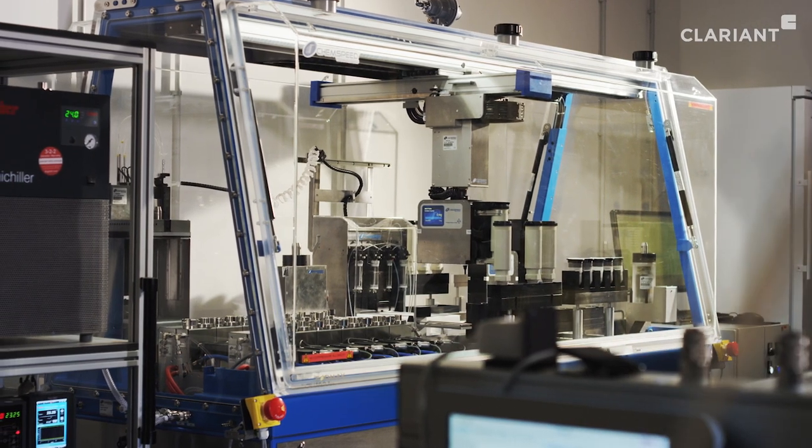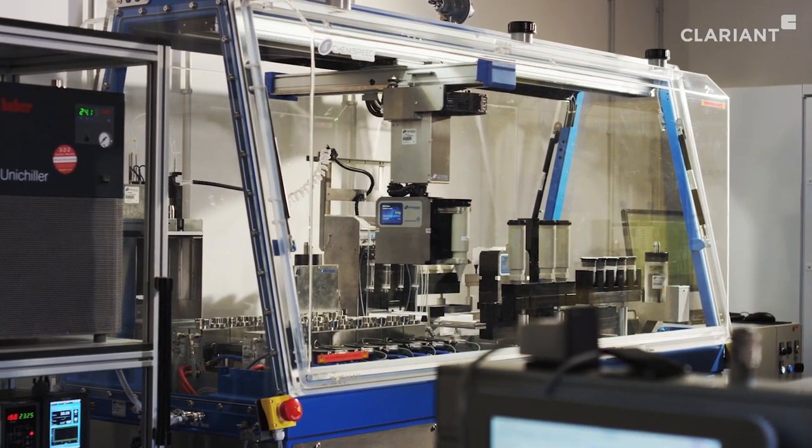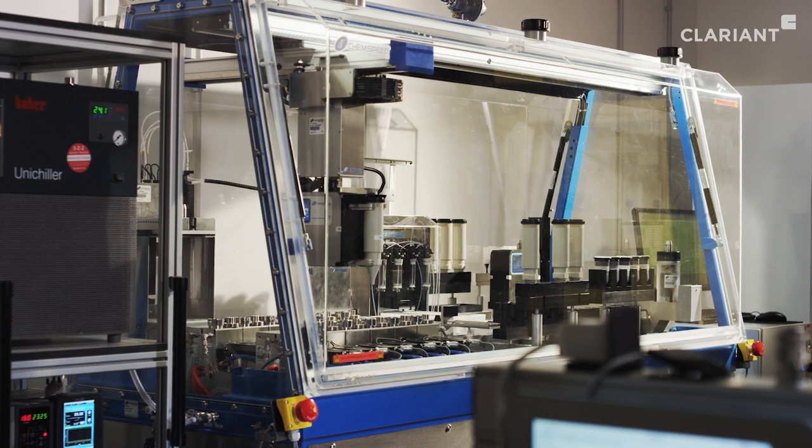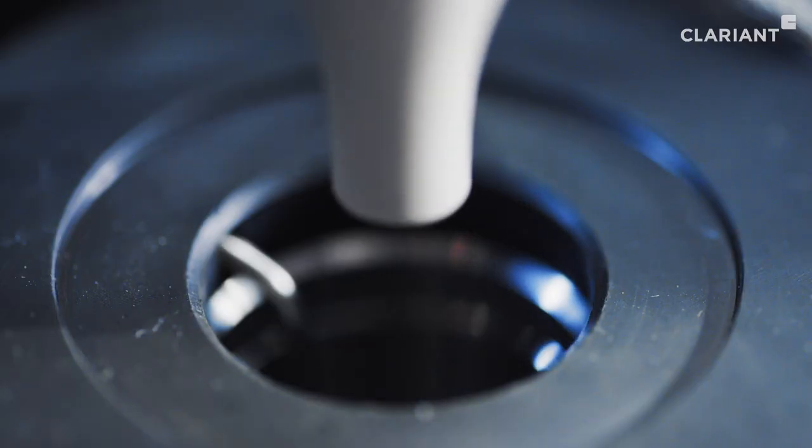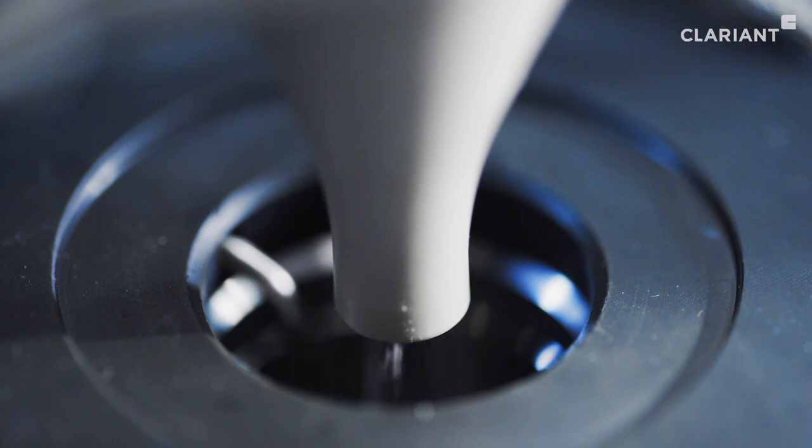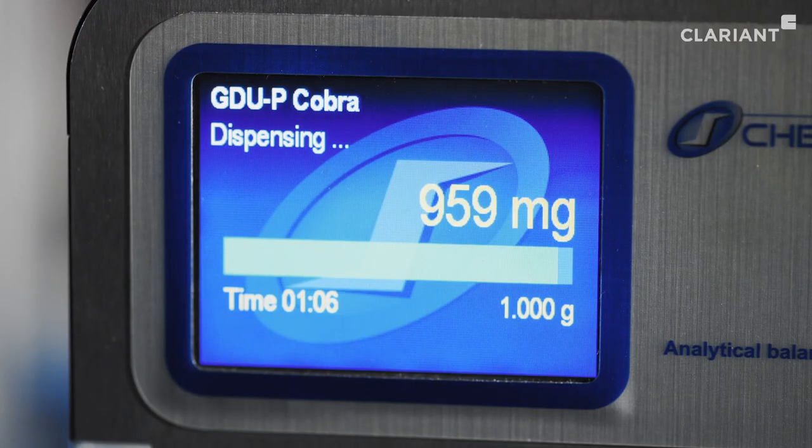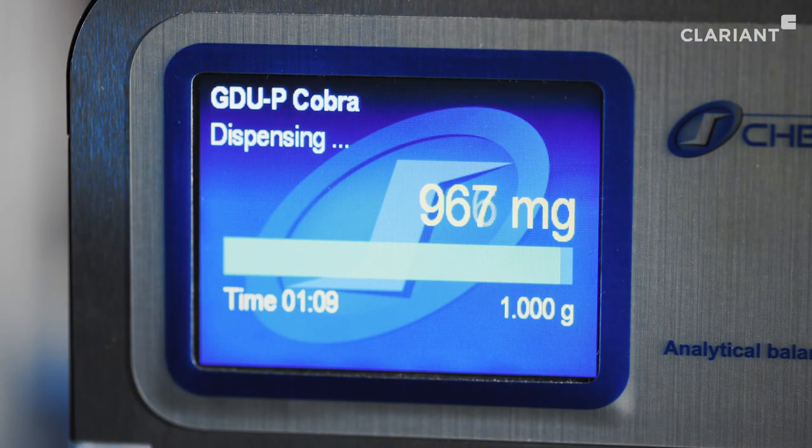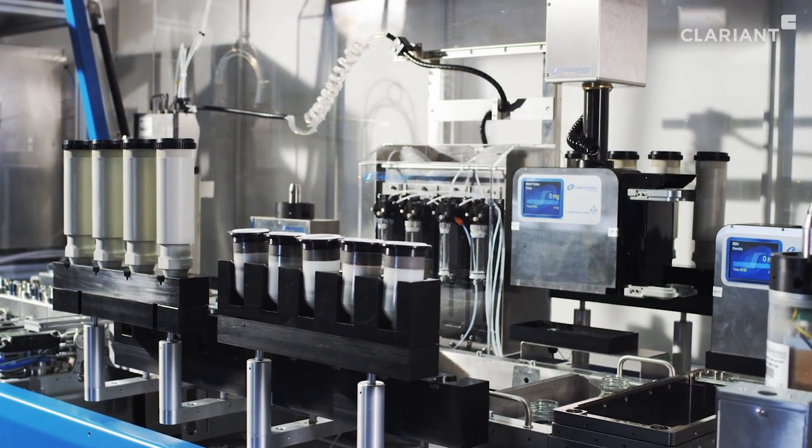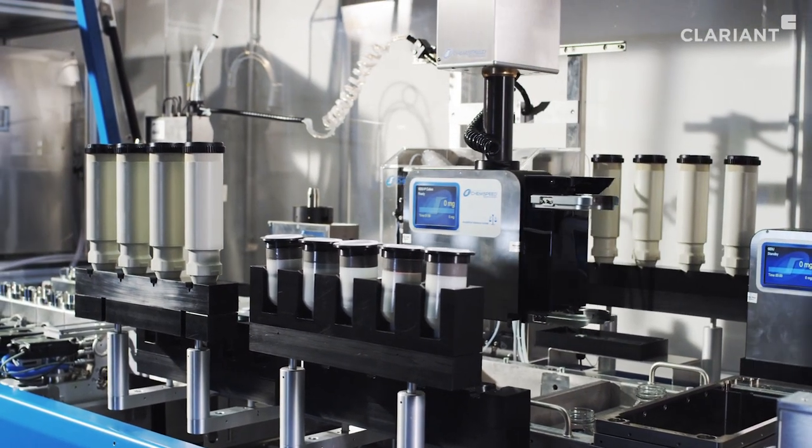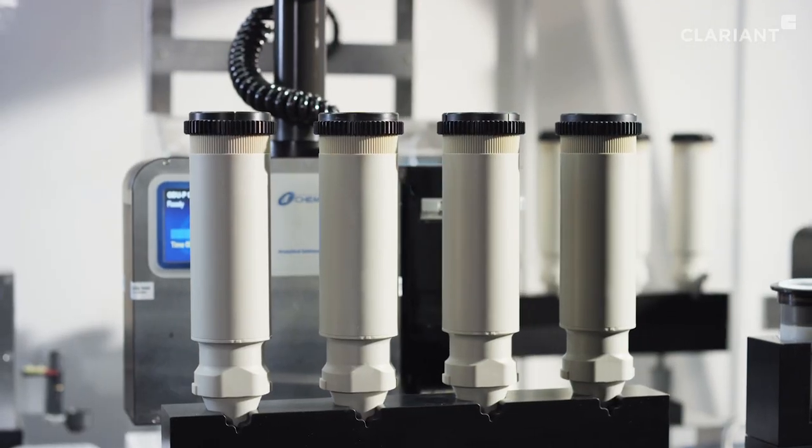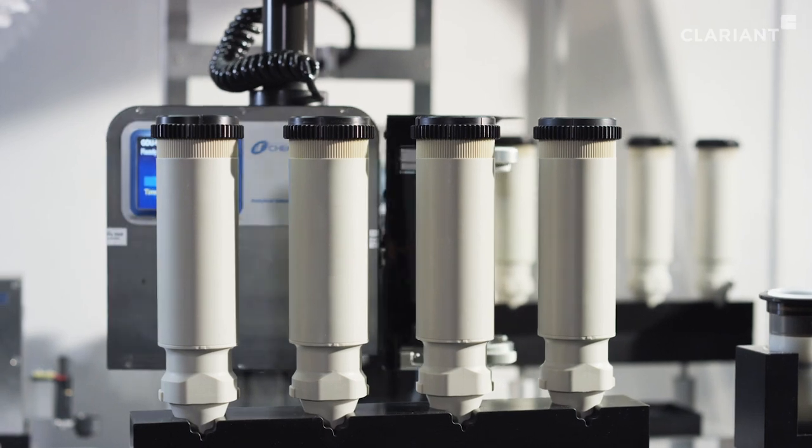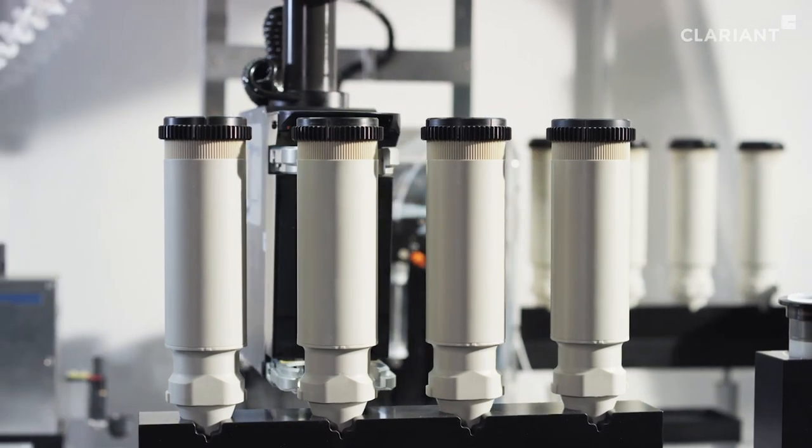If high-energy mixing, temperature control, or pH monitoring are required to complete the formulation, our high-end formulation system provides these capabilities. It has all of the dispensing power as the automated dispensing system with the addition of 12 individually controlled formulation reactors. This allows recipes as well as process conditions to be screened simultaneously.